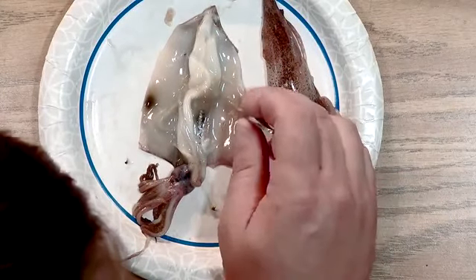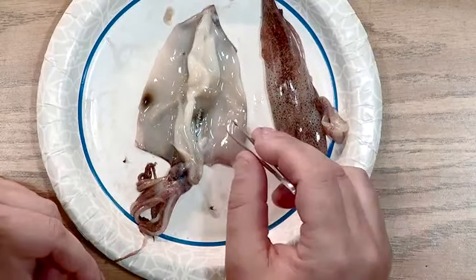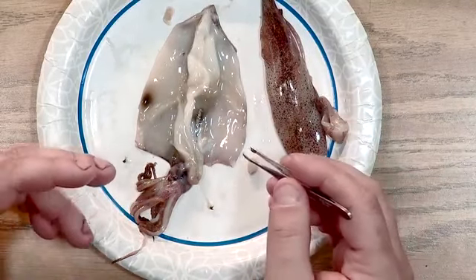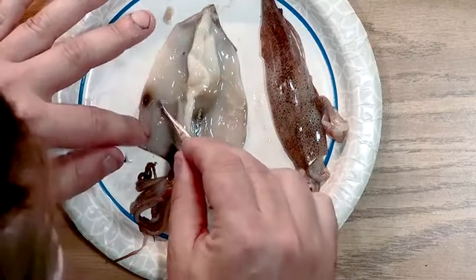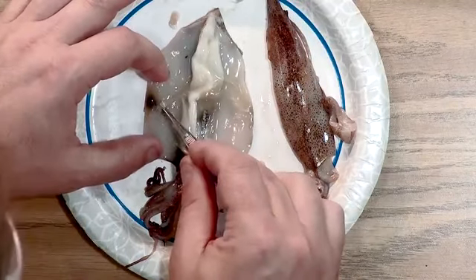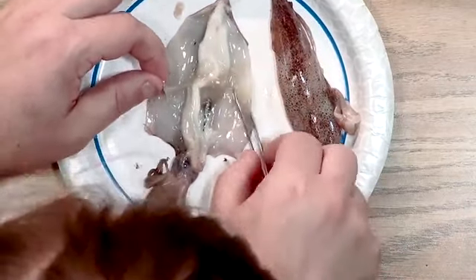All right, so going back in here, one organ that we are not going to be able to see is the heart. Now, squid, little trivia for you, actually have 3 hearts. They have one systemic heart that operates their entire body, and then each gill has its own heart. Now, the gills, or like the lungs, are over here on the side, and they attach to the mantle, but with a little help, I can kind of separate them.